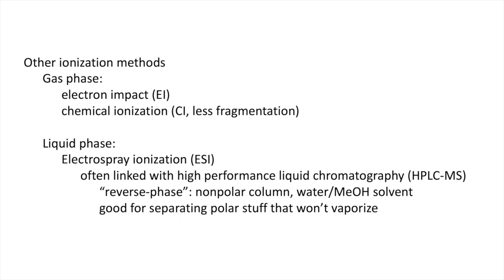What I want to focus on is liquid phase stuff. So what about molecules that I can't get into the gas phase, right? We were lucky to get eugenol in the gas phase. We needed to do steam distillation to make that happen. What about big molecules like proteins that I'm never ever going to get to actually boil, right? Then I have to be clever.